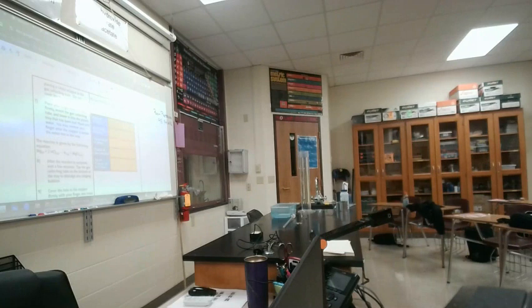By the way, don't forget to make observations in every spot where it said to make observations, ladies and gentlemen. Look at the lab and see what you're supposed to be observing. Yes, you still have to fold it in half twice to make the cage around it. I just need to make it smaller for you, otherwise it's going to be too big. You're not going to be able to collect that amount of gas.